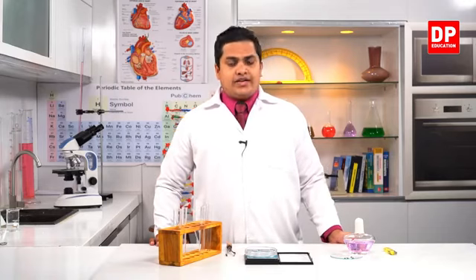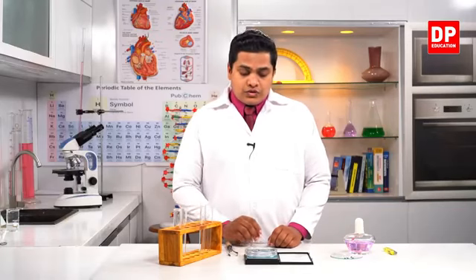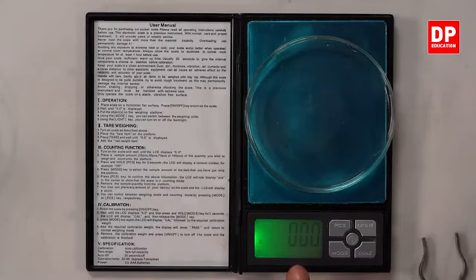So I have these materials. First of all, here I have a balance. This is a digital balance, and it is very sensitive. We can measure up to 2 decimal places, and here you can observe it's printed grams, G. So here the mass is given in grams. Very sensitive digital balance. On the balance there is a petri dish, and you can observe now the scale is at 0.